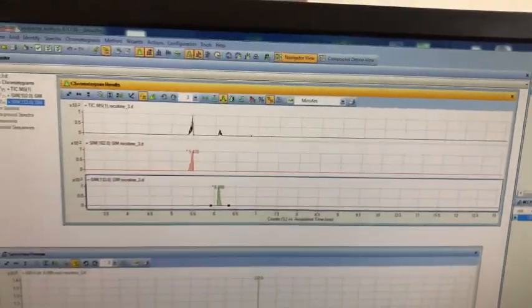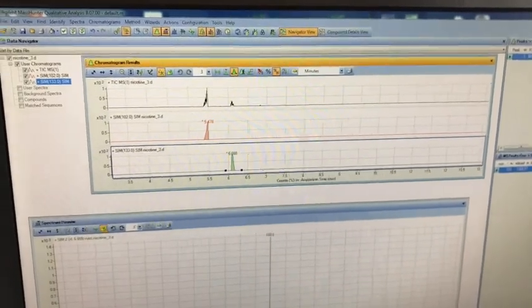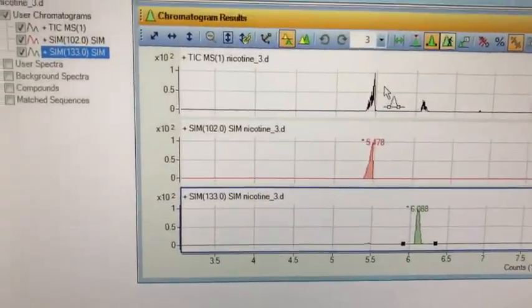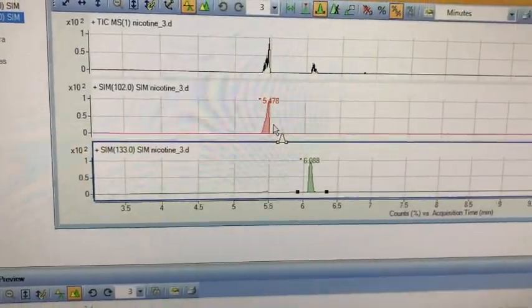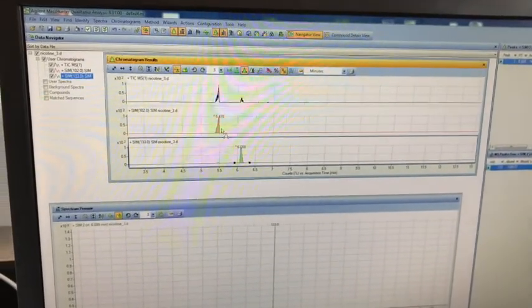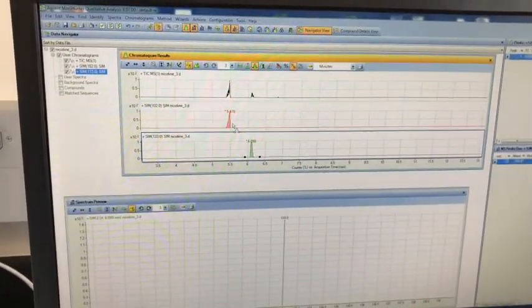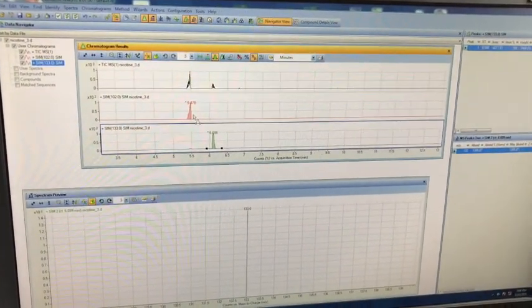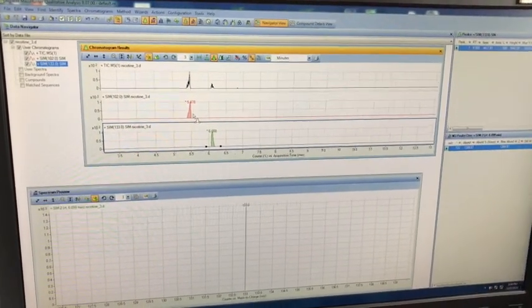We're going to do this for each and every calibration point, getting the area count for quinoline and nicotine. The quinoline is analyzed at m/z 102, and the nicotine at m/z 133. We're then going to use this to plot the ratios of the two using the internal standard method for graphical analysis. From there, we can get the concentration of nicotine in our e-cigarette sample.